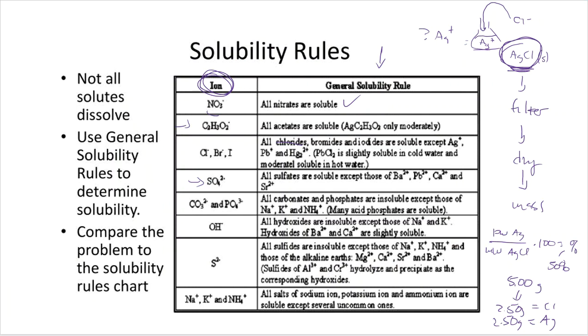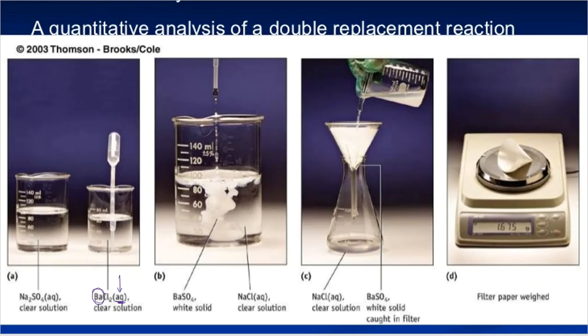They all will stay in solution, except barium and lead and calcium and strontium. Only 4. Only 4 off of that periodic chart? I think that's a pretty good reagent to choose if I'm interested in this barium. So that's why we have sodium sulfate as the reagent that we're going to be adding in.